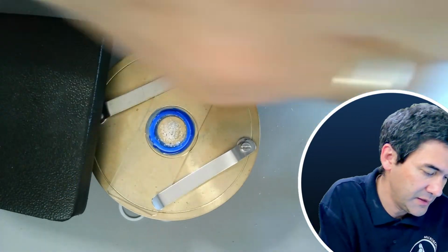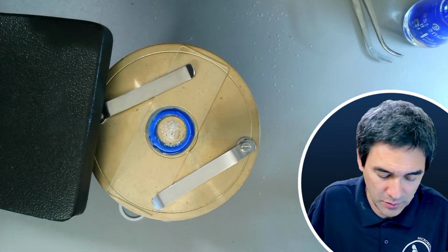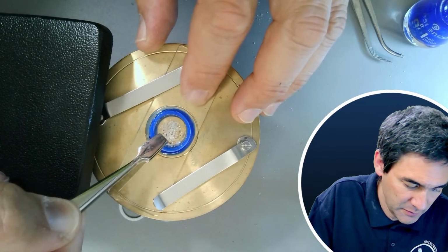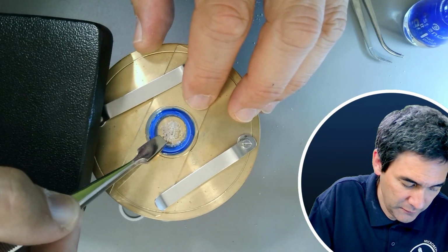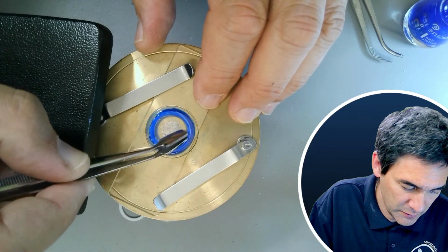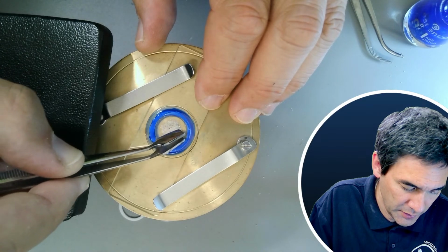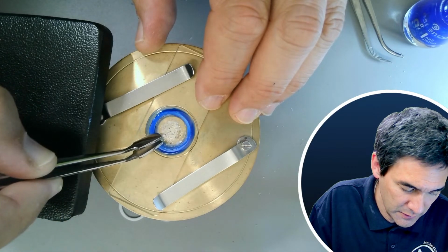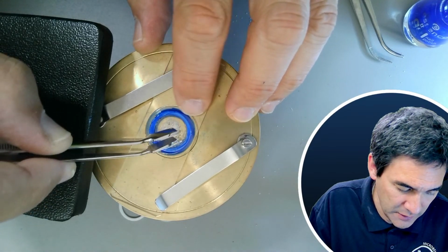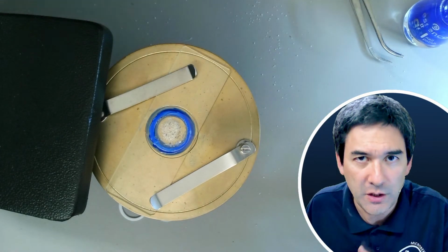So let's try this here. If this actually works, very quickly before it dries, it's a little bit difficult to see if it is properly centered or not. Yeah, I think this actually made pretty good contact. Another thing that you should be aware of every time you use nail polish is that it starts to shrink quite a bit when it dries.